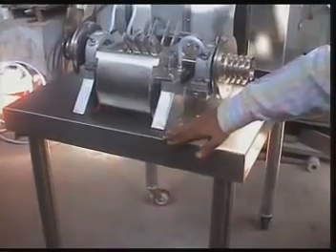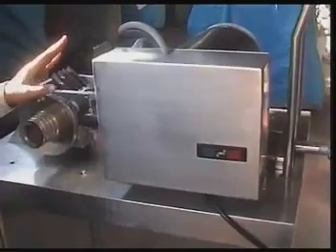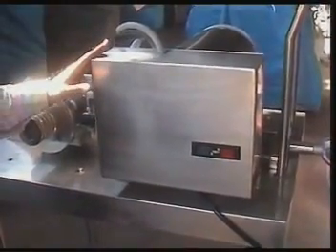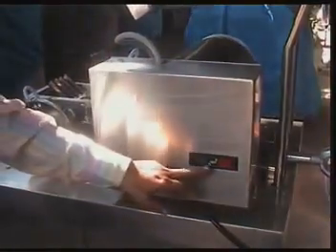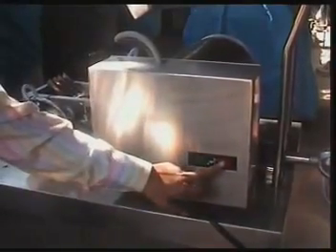This portion is considered as the front of the machine. This is the main starter of the machine. The starter is a star delta starter, fully automatic operating, and it has only two simple buttons — green for starting and red for stopping the machine.